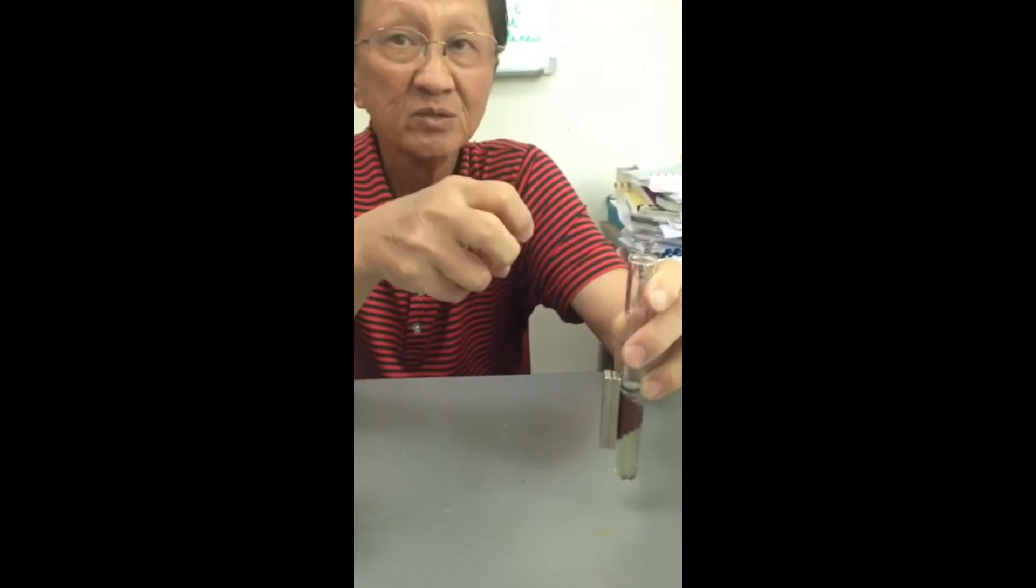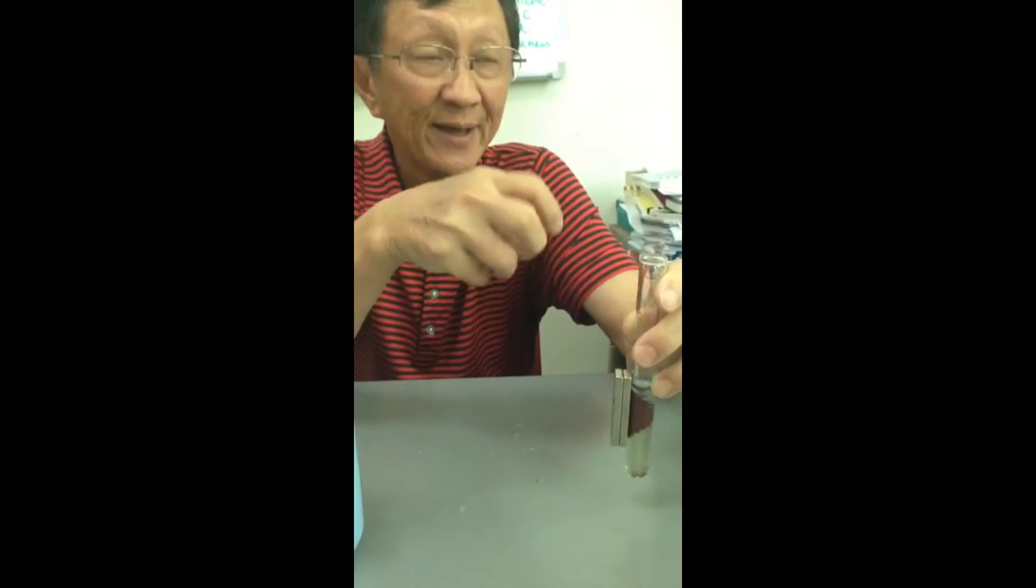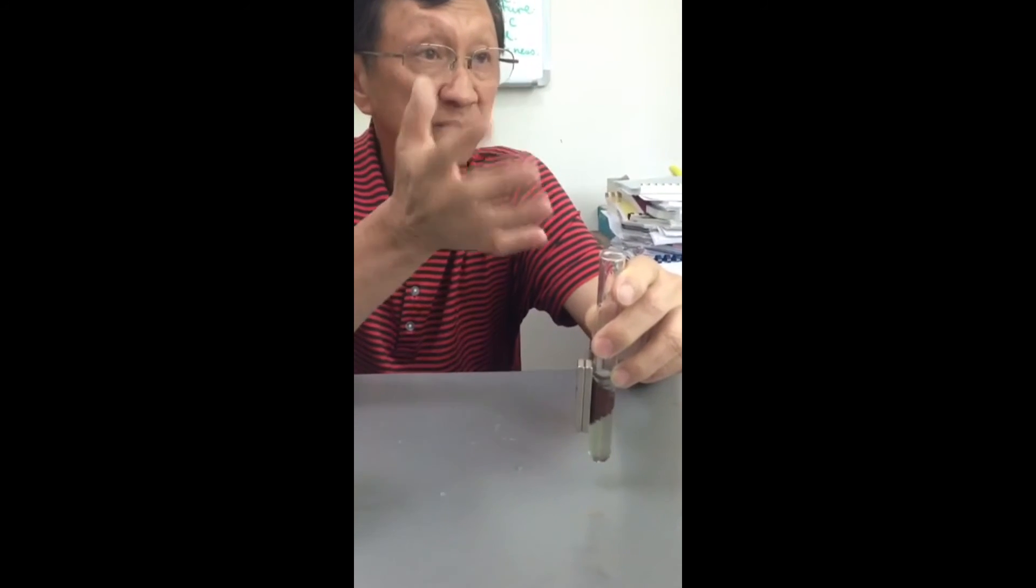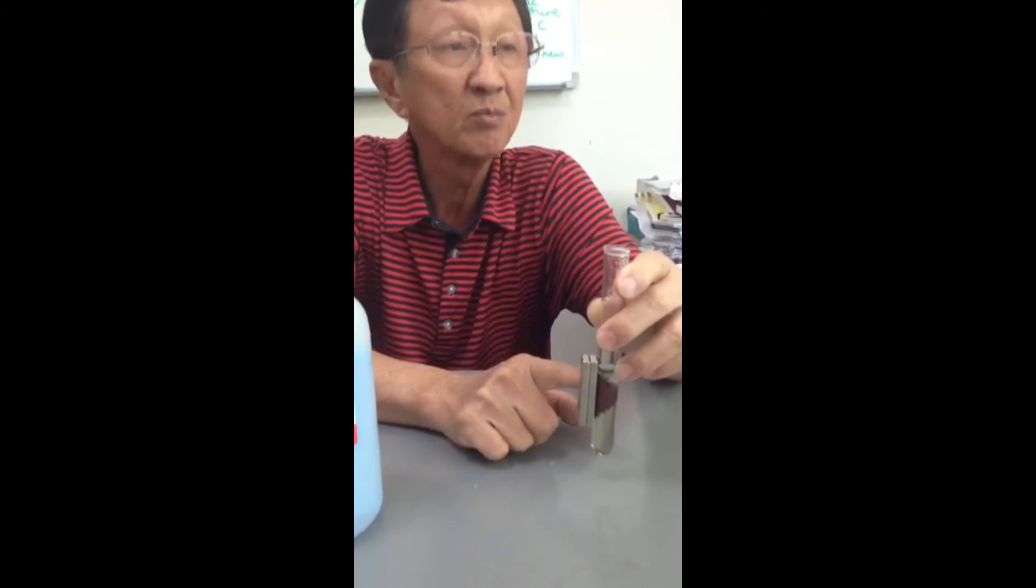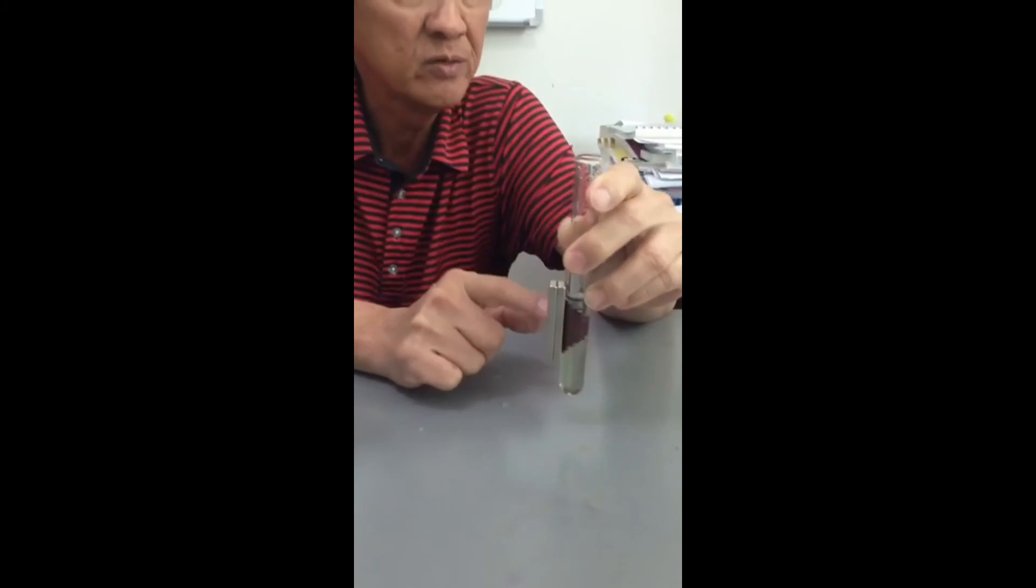Because in this reaction you have a solid reactant, which is iron filings. And then the copper comes out and coats over the iron filings, because reaction occurs at the surface of the iron filings. So it coats over, and the solid product coats over the solid reactant.